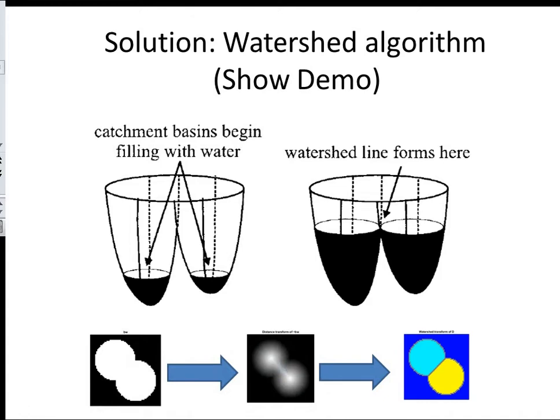So this is basically the inverted image, right? If you invert this image, you can get a sense of what I mean by distance transform, meaning that the more apart the pixels are, the larger the distance. Then you have to invert them before you do watershed segmentation, meaning that all the pixels which are very near are brighter, right? You can see it here.